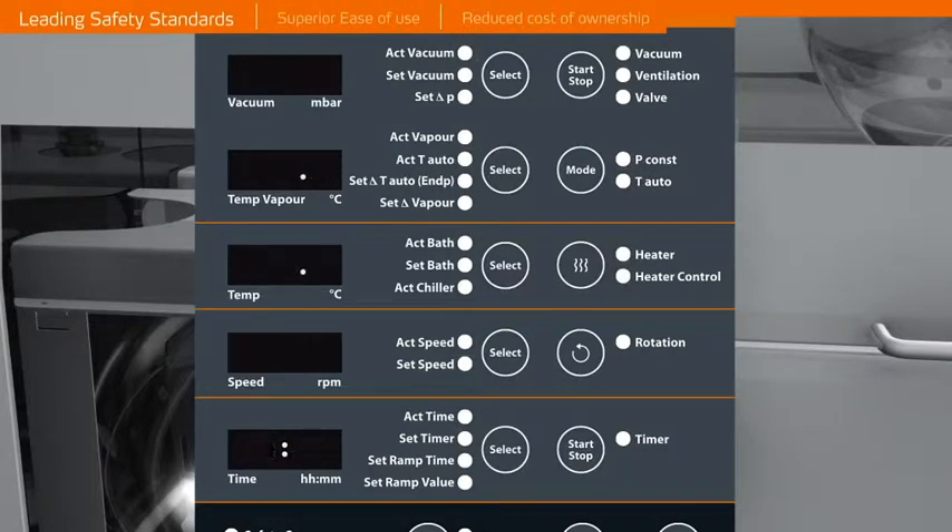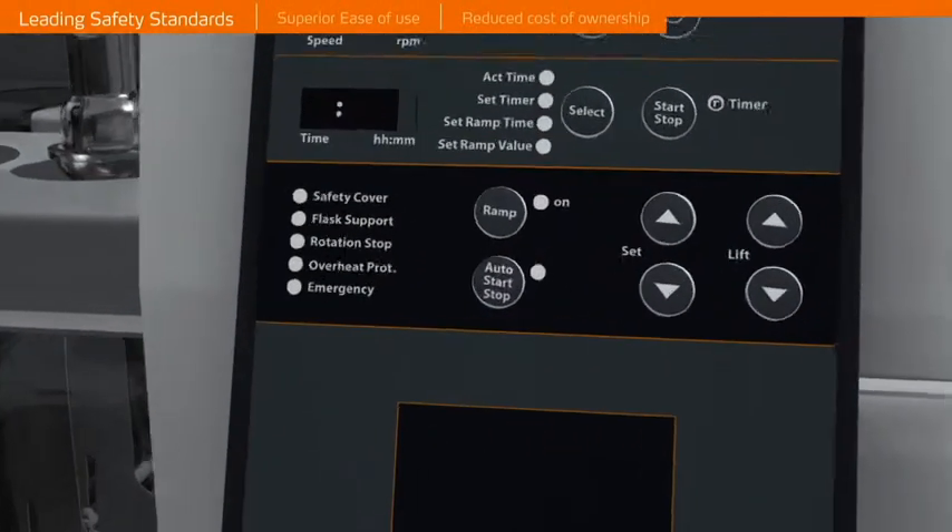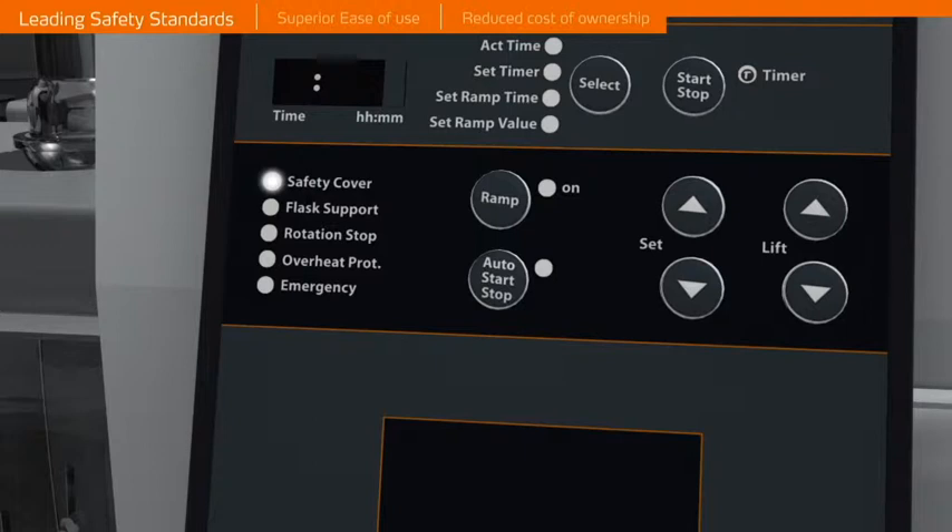For your safety, the unit will prevent operation especially in these particular cases: if the guard hood is open, if the flask removal support is not in place or locked, if the rotation drive is locked, if the over-temperature cut-off is activated, and if the emergency cut-off is engaged.